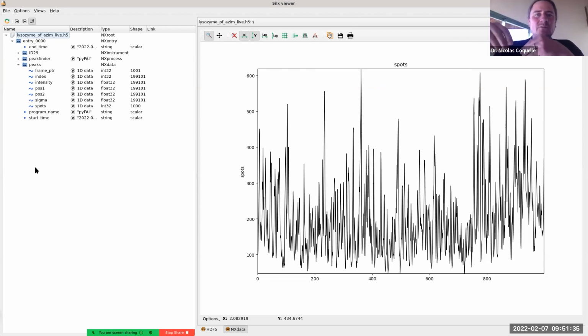Then you don't have to go from scratch and perform peak finding, but you can just narrow down the number of Bragg spots which have been found at this first stage while the images were still in memory. So that's the idea, then to see how it can be properly implemented.